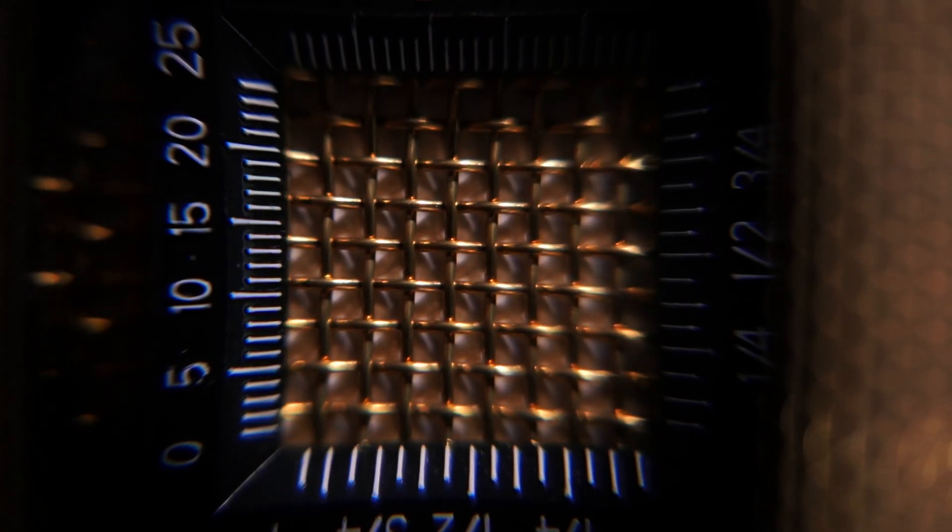Once removed from the loom, the mesh must be visually and physically inspected for any sort of flaws or imperfections before being classified as testive cloth.